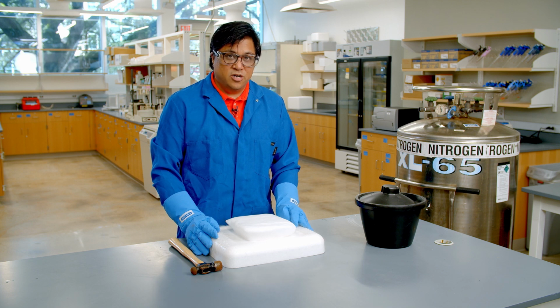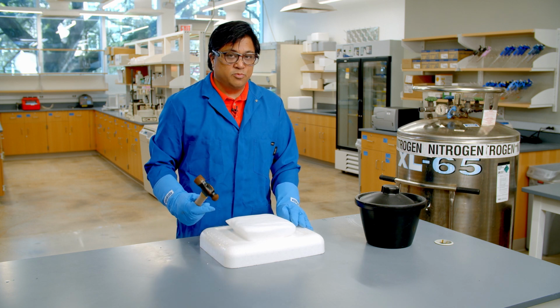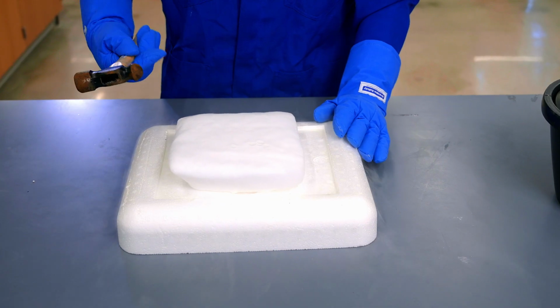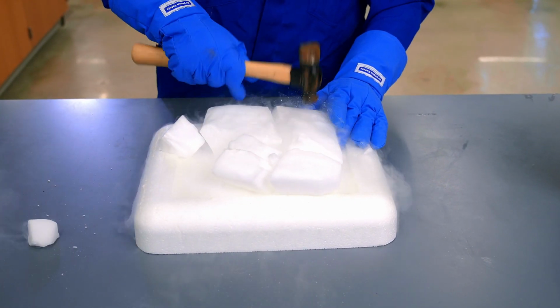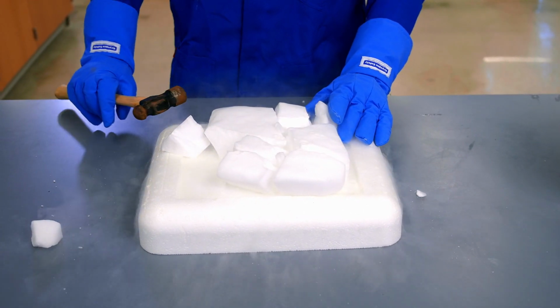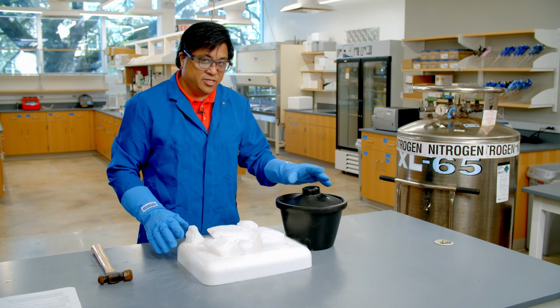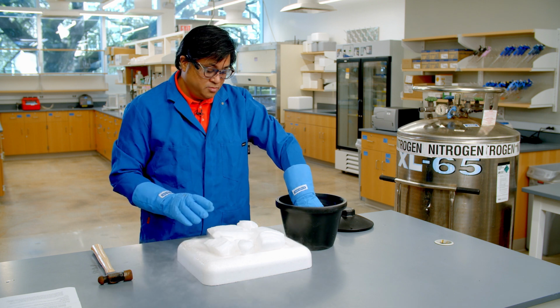Dry ice usually comes in large blocks such as this. You can use a hammer to break it up into smaller manageable pieces. Be gentle, it doesn't take that much force. Now that we're done, we can transfer these pieces into an appropriate container, such as a styrofoam bucket or any kind of container that is rated for cool temperatures.